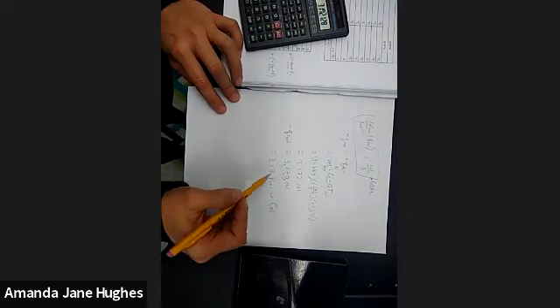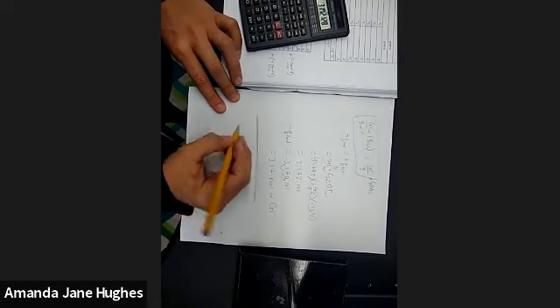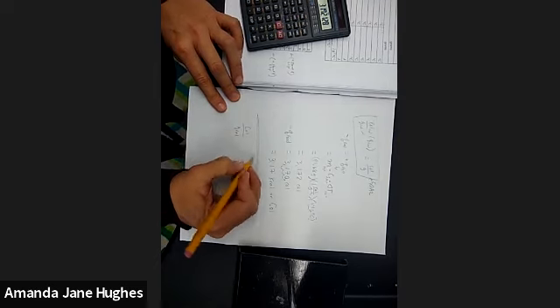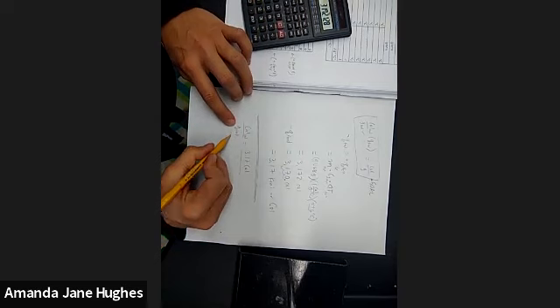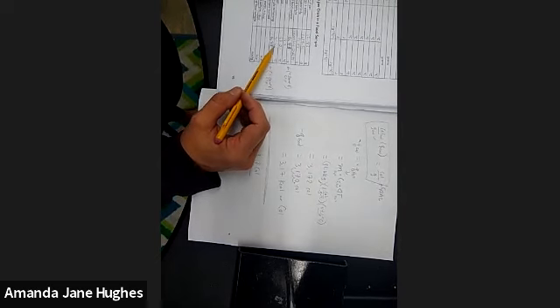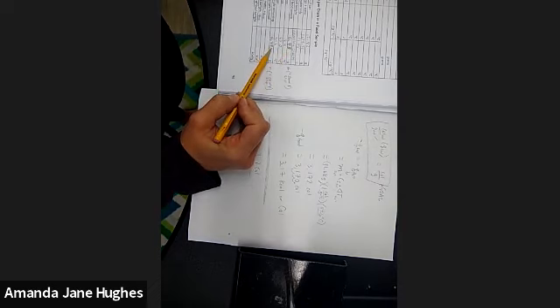And then I'm almost done. So here we are back at our goal. We wanted big Calories per gram of food. And I figured out the Calories of the food is going to be 3.17 Calories. Now I just need to divide that by the grams of food that was combusted. So I'll have to come back over here to my data table, and the amount of food that was combusted is going to be the difference between the initial mass of the food and the final mass of the food sample. So we'll go initial minus final.